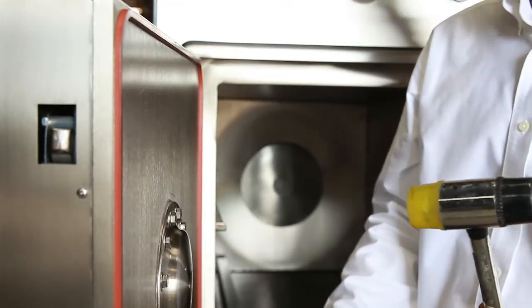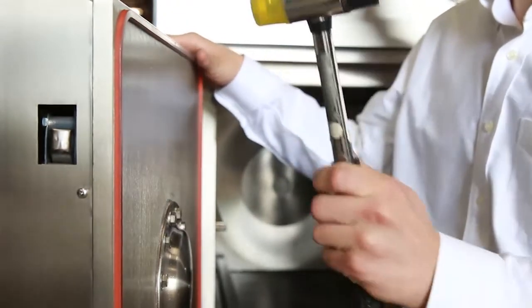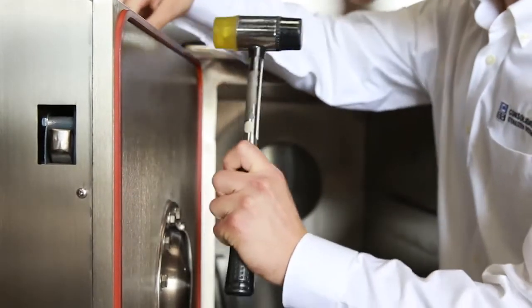Once the gasket is in, now we need to seat it evenly. Take a rubber mallet and press the gasket in firmly all the way around.